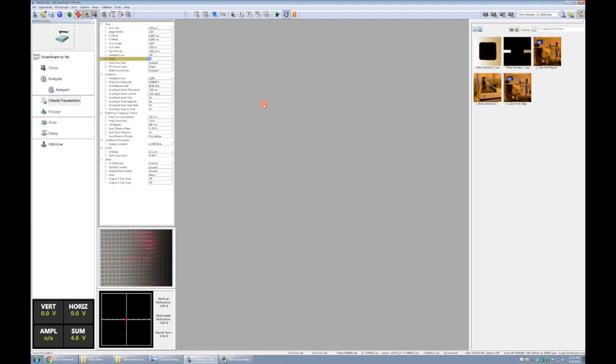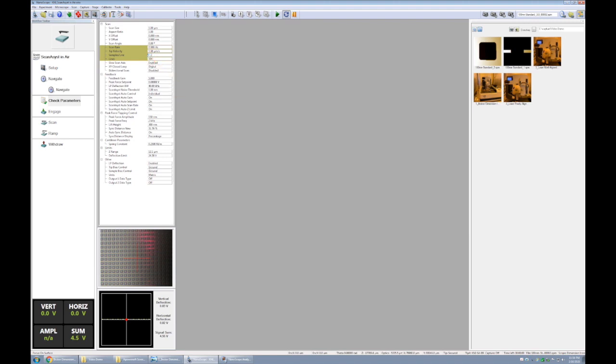This we'll see as a way to quickly scan on the y dimension to get a quick view of your sample while still maintaining good x resolution. It's also a good way you can always add in a lot more pixels and get really good resolution. Say you're going over a waveguide, you want to get great resolution for every line you scan, but you don't need to scan every pixel along the y. You just want to jump from line to line to line.